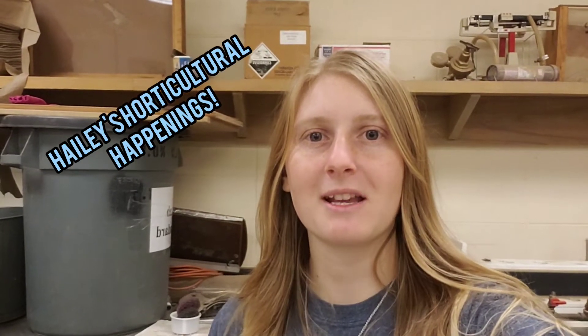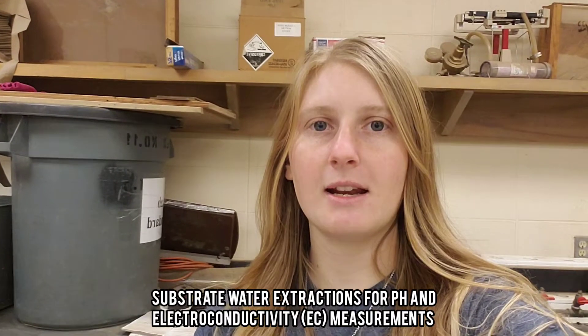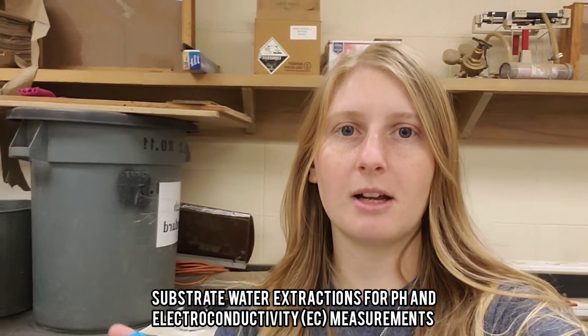Welcome back to Haley's Horticultural Happenings. Today I'm doing some work for my thesis for my master's degree — I'm testing some substrate for EC and pH. I'm going to show you how I get the soil extractions in order to test that, so stay tuned.